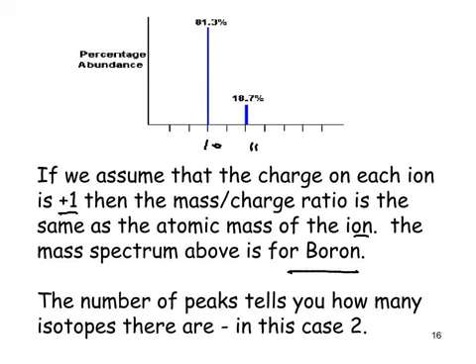What it's saying there is, of course, had one of them been 2+, if you have your mass divided by your charge, now if the charge is 1, you're simply dividing the mass by 1. So in fact the mass to charge ratio is simply the mass, given that the charge is 1. But had it been a 2+ ion, then in fact what you're getting for that peak is half the actual mass, given that you're dividing the mass by the charge, which in this case would be 2.